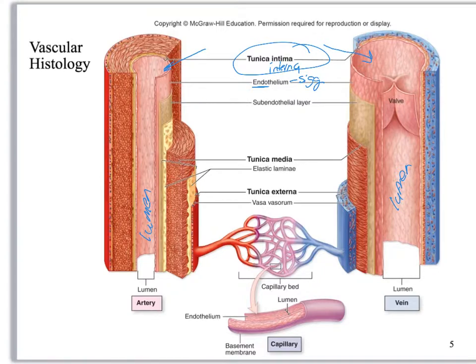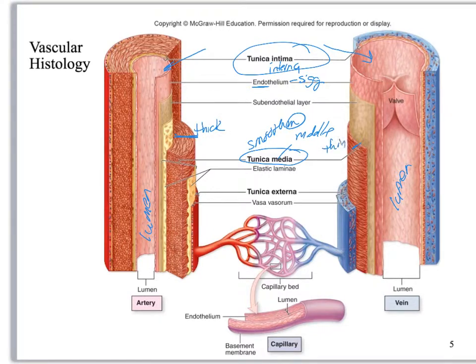The middlemost layer is called the tunica media — media for middle. This consists of smooth muscle, and you can see it here. What you should notice is that on the artery it's thick, and on the vein it's really thin. Also notice the elastic lamina on the artery — there's none on the vein. Elastic lamina and the thickness of the tunica media are features of arteries.